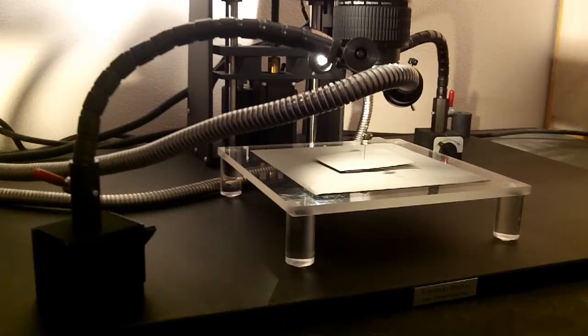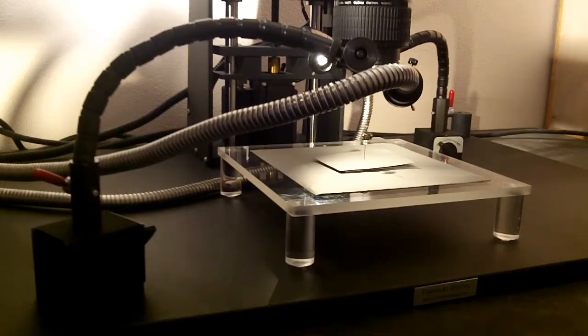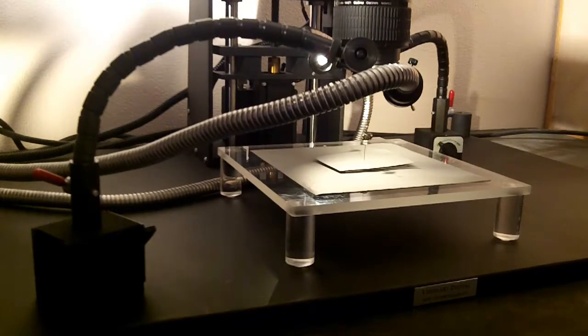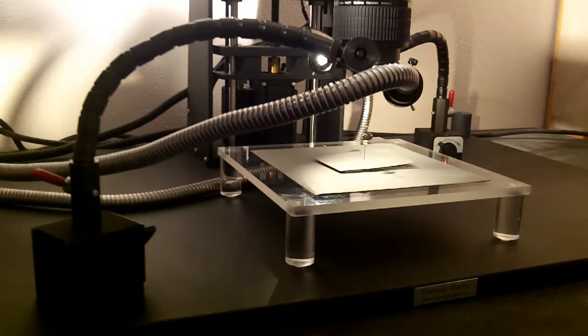Fiber optic cables can be a great tool when you need a lot of intense light shown directly on a specimen or any other subject.